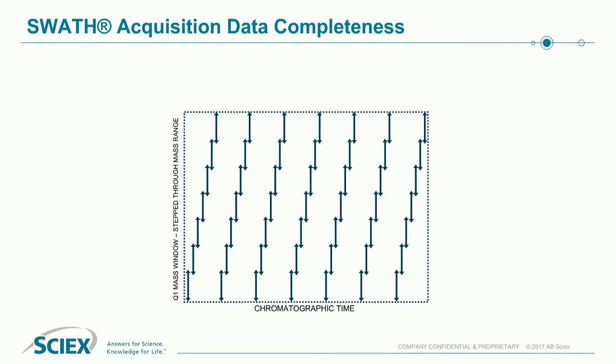The SWATH-MS method essentially uses a wide isolation band filter in the first quadrupole. This is the part of the mass spectrometer which will isolate different compounds, in this case peptides, and in this case we use a wide isolation filter to allow us to cover the whole mass range. But this does mean that there are many different peptides which are co-isolated and fragmented at the same time.